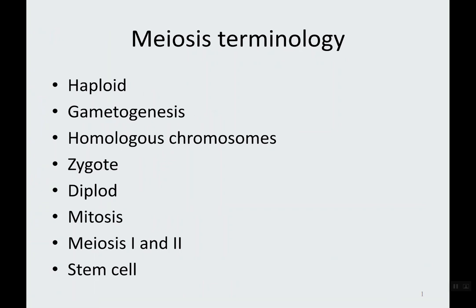So starting with slide number 1, I want you to remember that meiosis, let's underline that. Oh, I don't get to? Okay, fine. All right, I guess I'm just going to use my laser pointer instead.